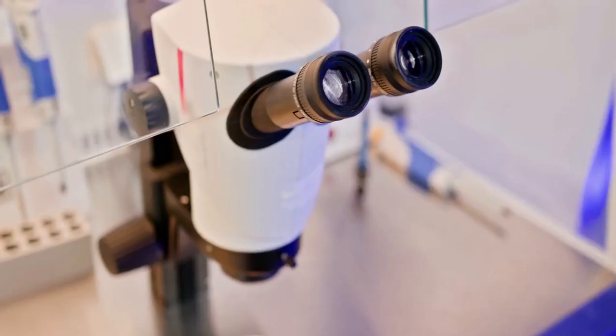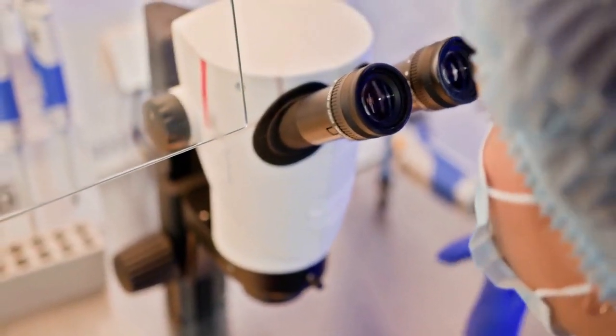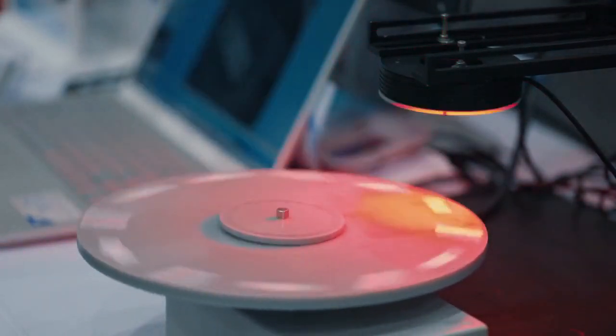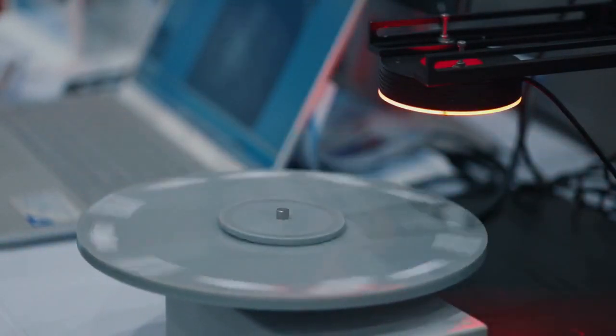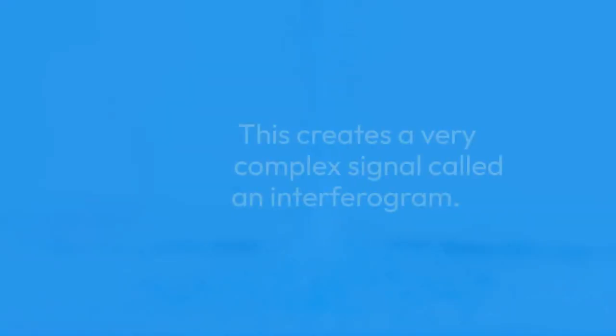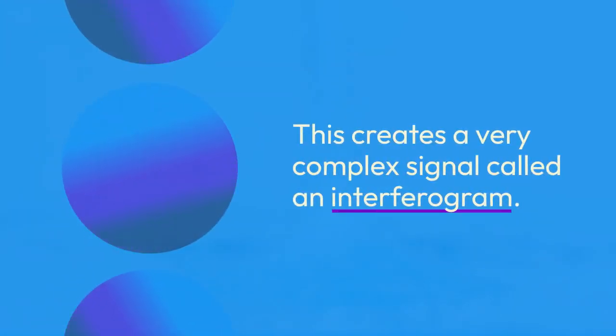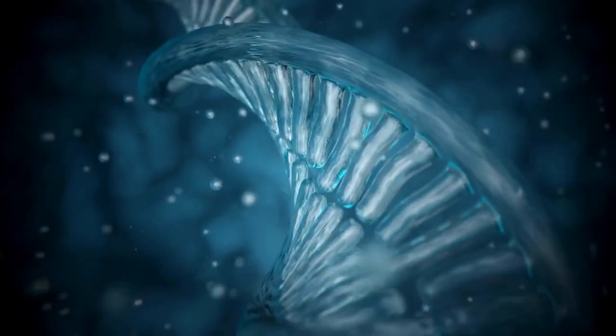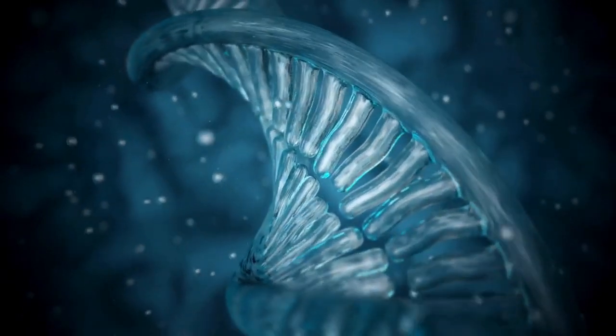Now, let's talk about FTIR, which stands for Fourier Transform Infrared Spectroscopy. This is the modern, powerful method. Instead of playing one note at a time, FTIR is like hearing the entire musical chord at once. It uses a clever device called an interferometer, which takes the entire beam of IR light, with all its frequencies, and passes it through the sample simultaneously. This creates a very complex signal called an interferogram. This jumbled-up signal contains all the absorption information from all the frequencies mixed together.